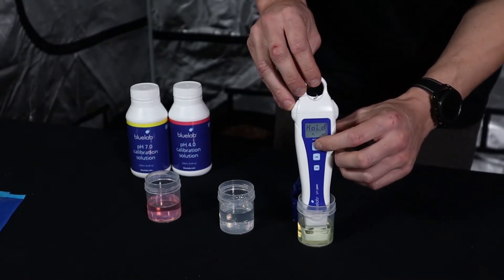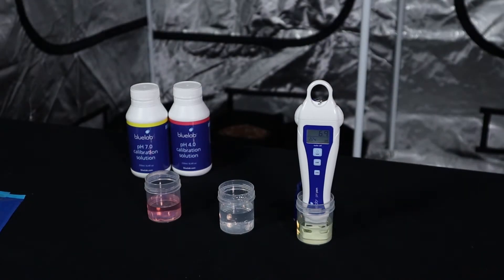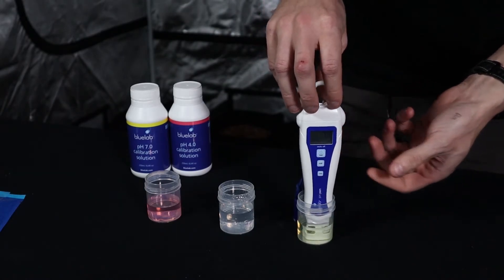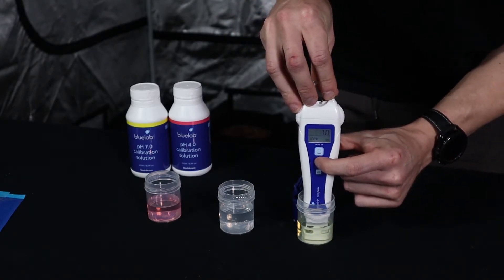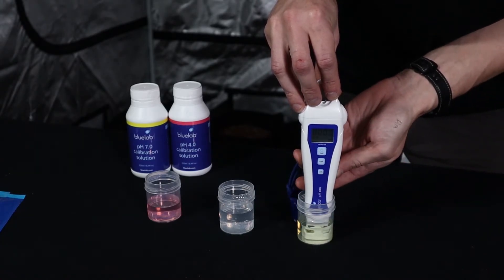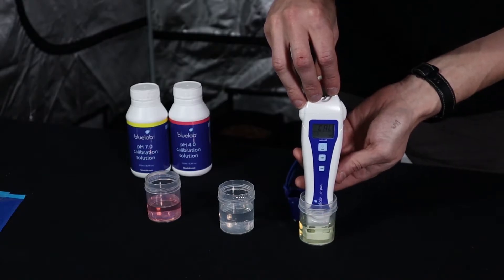We start with PH7. Remove the cap and expose the sensor to the PH7 solution, making sure there's enough for the sensor to dip in. Turn the pen on by pressing the power button. Give it about 30 seconds to equalize. It's sitting at PH7, which shows it's pretty well calibrated straight out of the box. Press and hold the Cal button, leave the pen in the solution while it loads — it will then display 'Cal' and '7' at the bottom confirming calibration.